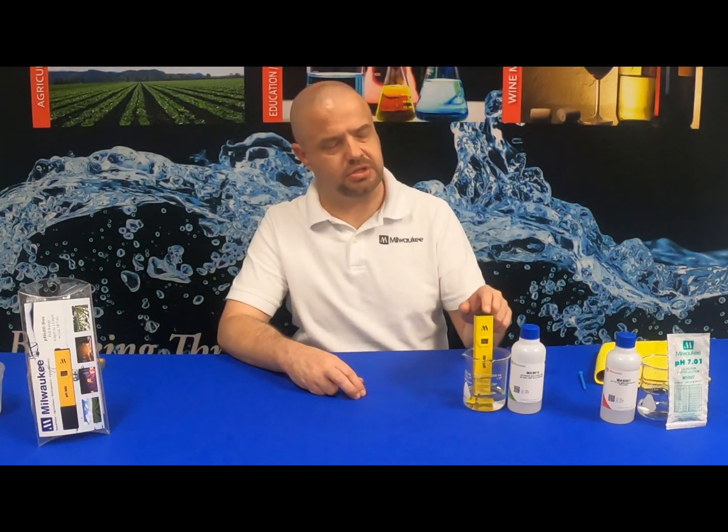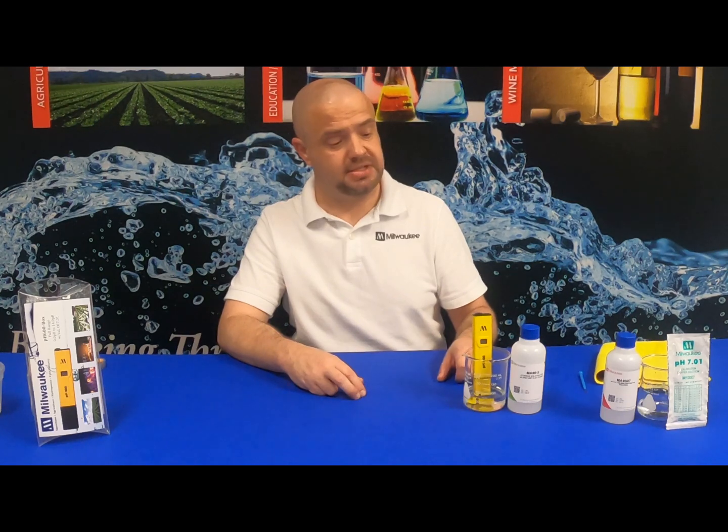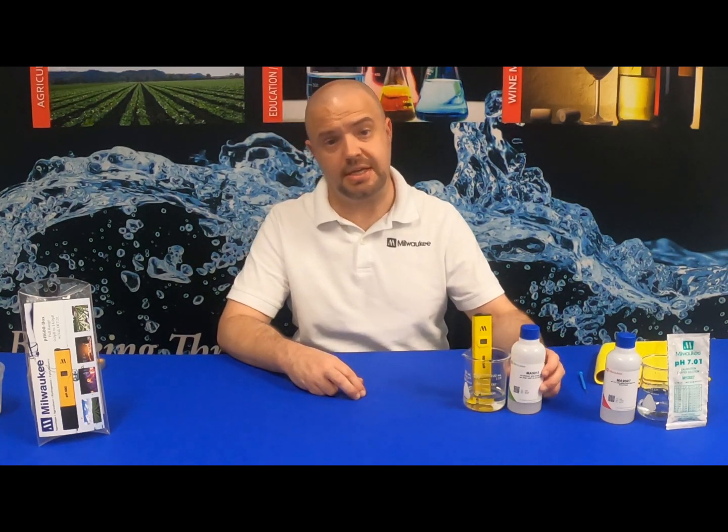Once you've cleared the crystallization off of the Milwaukee Instruments PH600 pocket tester, be sure to place it in Milwaukee Instruments MA-9015 storage solution for proper hydration and conditioning for a minimum of two hours prior to calibration.